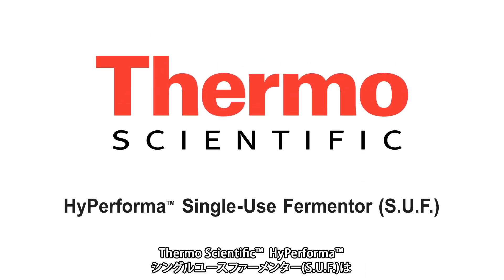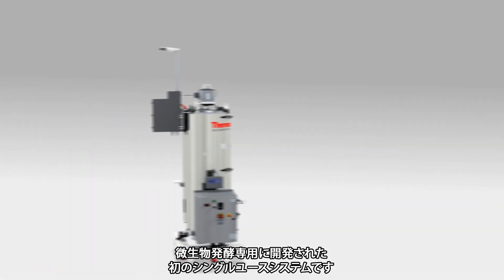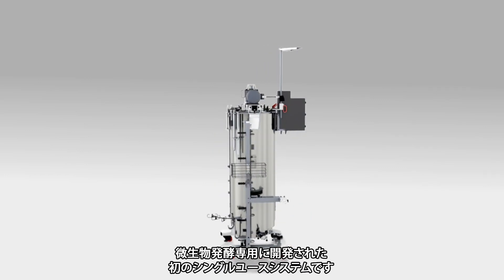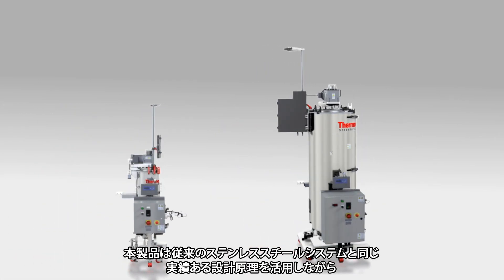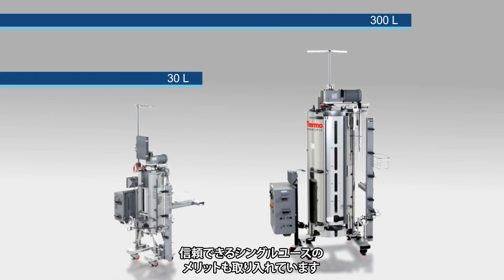Introducing the Thermoscientific Hyperforma Single-Use Fermenter, or SUF, the first single-use system specifically engineered for microbial fermentation. The SUF leverages the same proven design principles of conventional stainless steel systems while taking advantage of established single-use benefits.